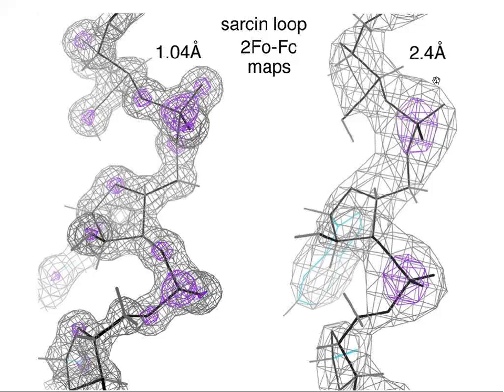You're very lucky to get 2.5 angstrom. Usually it's 3.5 angstrom structures of really big, interesting RNAs and ribonucleoproteins. And so on the right is exactly the same piece of the sarcin-ricin loop from the 50S ribosome. And you can see the phosphates still marvelously, since they're essentially spherically symmetric. They show up at all resolutions pretty well. And the bases are big and flat and pretty recognizable anywhere. But the rest of it is really very undistinguished at this sort of resolution.